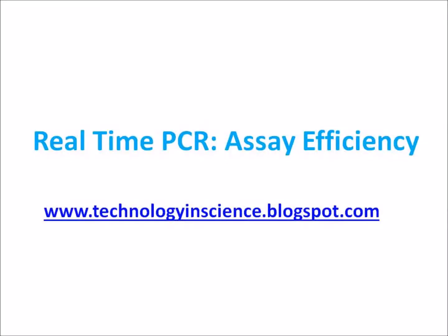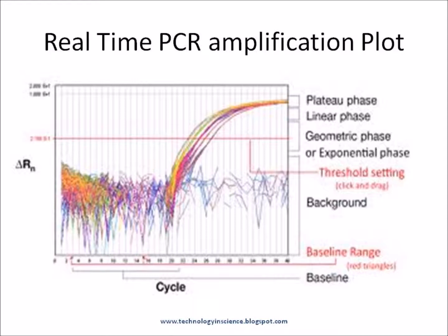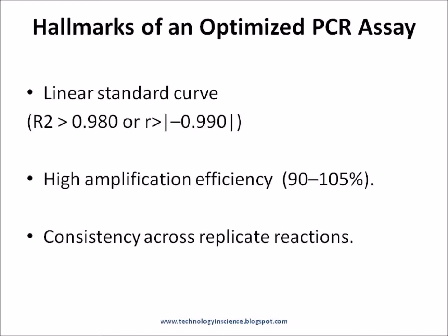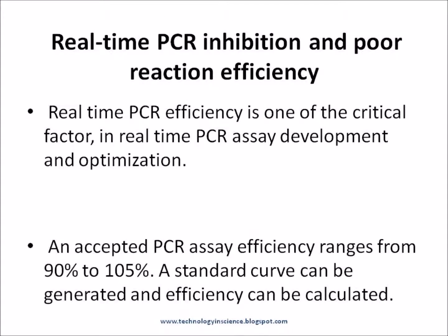The hallmarks of an optimized real-time PCR assay are a linear standard curve, high amplification efficiency, and consistency across replicates. Real-time PCR efficiency is one of the critical factors in assay development and optimization. A 100% efficient PCR result indicates a well-optimized assay, while below that indicates a need to further optimize reaction parameters, which includes primer and probe concentration.